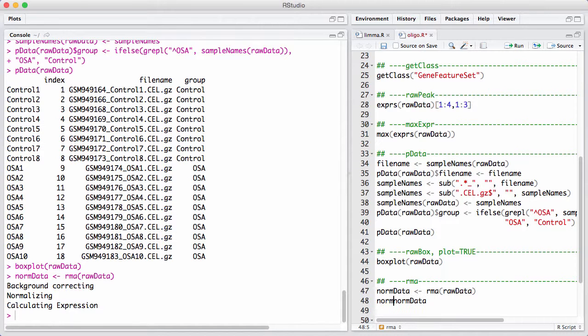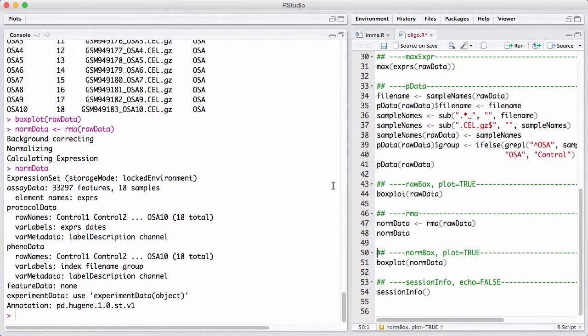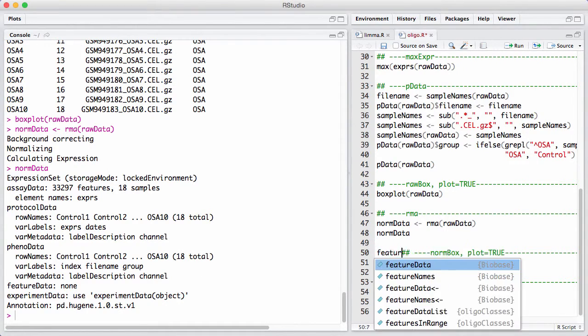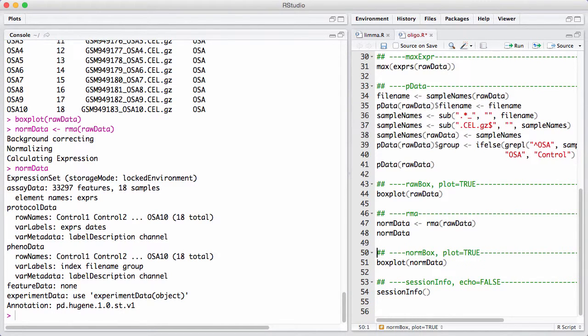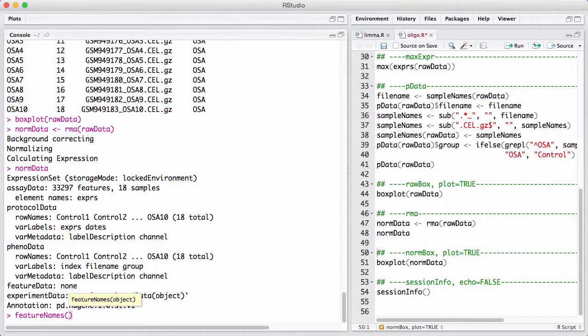Let's look at the normalized data. Now we're back on something we know and love. It's the expression set. And we see we've gone from one million features to 33,000 features. That's a quite massive reduction. And this is happening because all the probes that measure the same thing has been summarized into a single number at the gene level. We can have a little look at the feature names of the expression set.